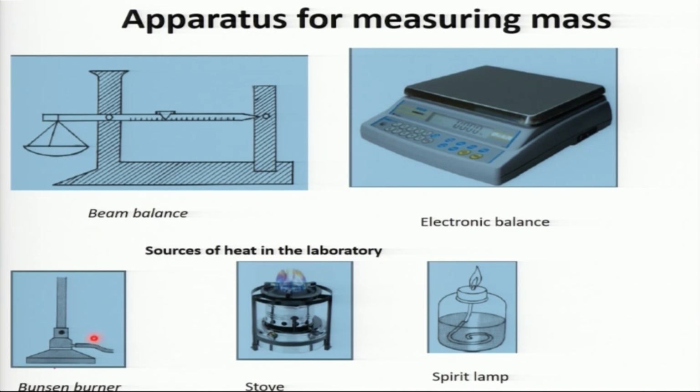In the modern laboratory, we find there a Bunsen burner. All right? So these ones supply a source of heat. They supply heat. All right? So we need also those ones in the lab.